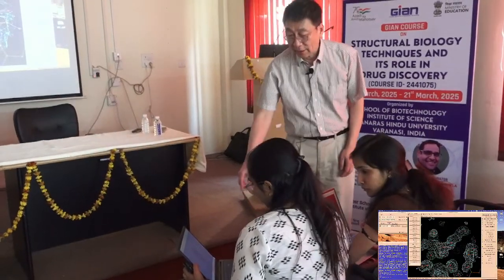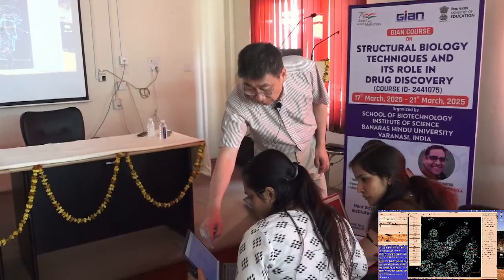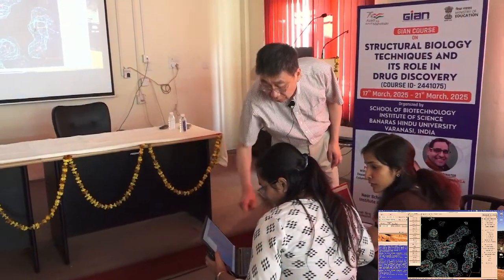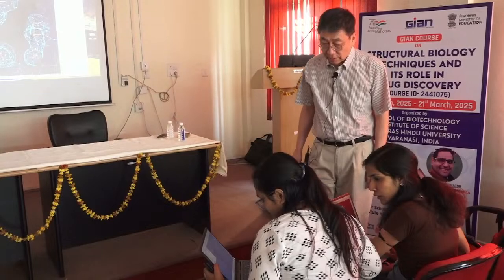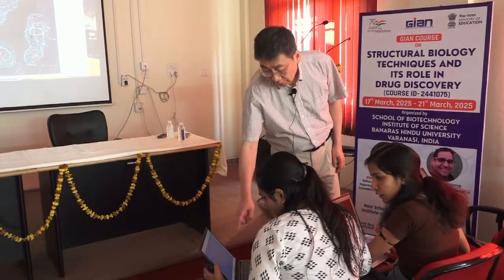And then the map radius is too big, so edit. Map parameters. Yeah, make that 7. So the first number, make that 7. And say OK. And then spacebar. That gives you the residue 1.